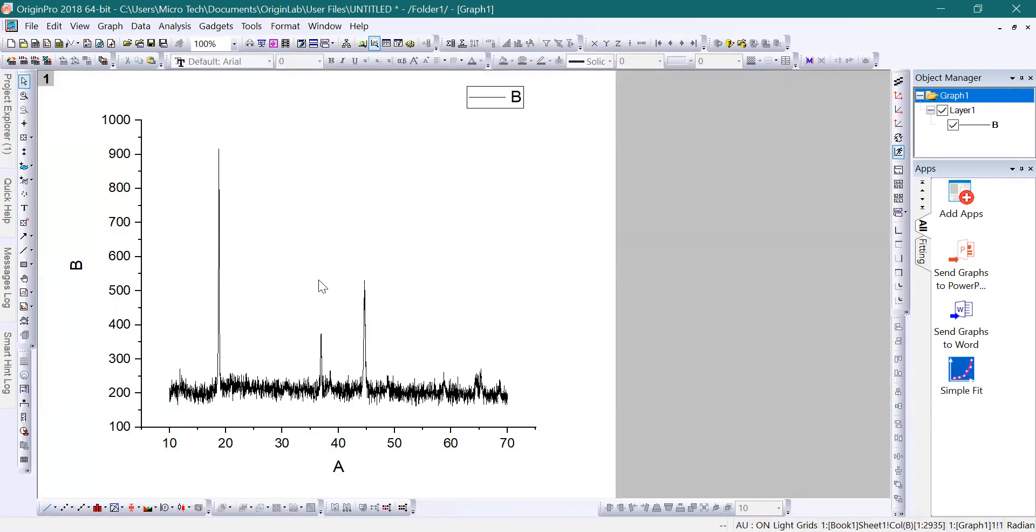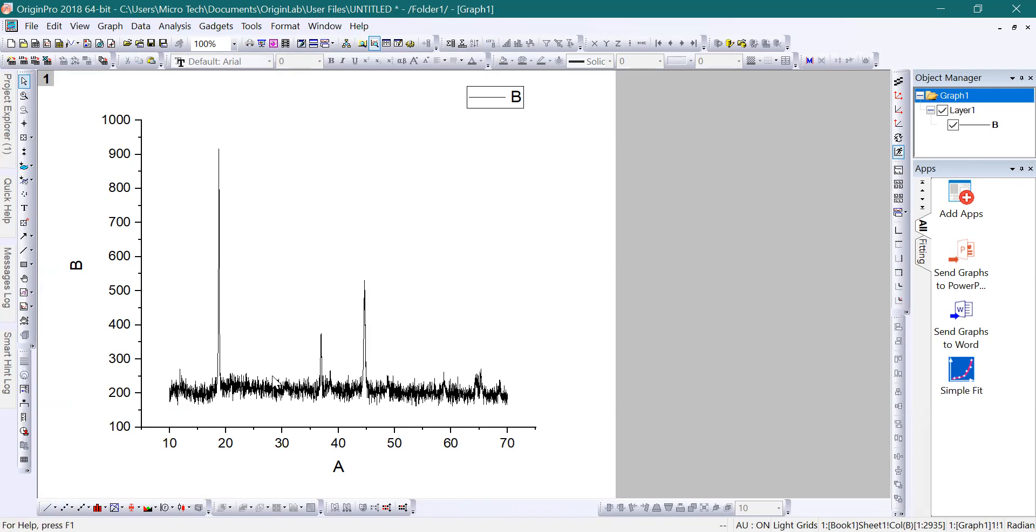This is how we plotted the data: by copying the data from the text document and putting it in the Excel file, then cleaning the data from the commas, copying the data from Excel and putting it in Origin, selecting both columns, and clicking on Plot. Now we have a nice plot for the given data. That's all for this lecture, thank you.